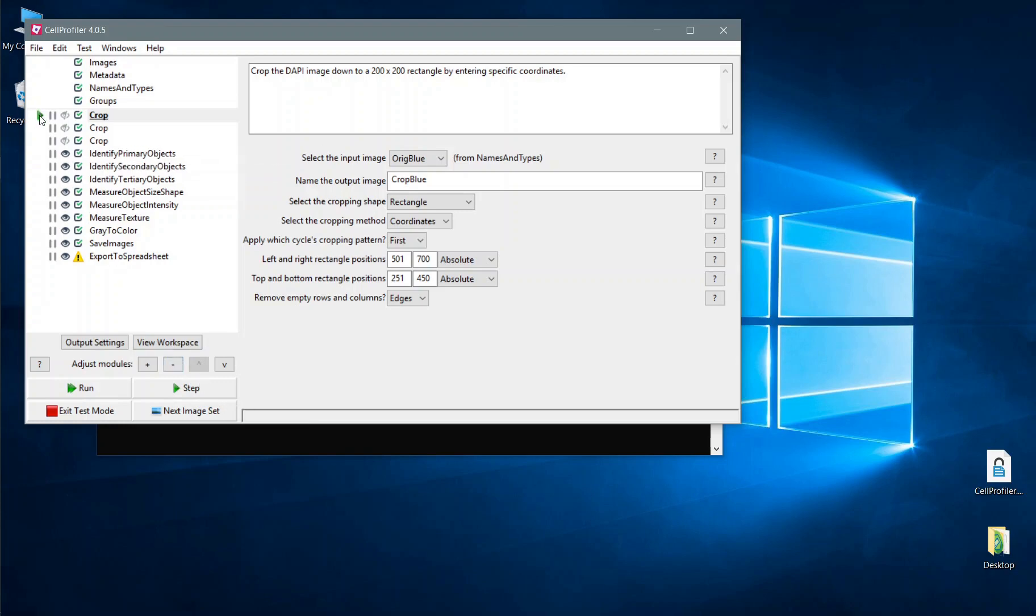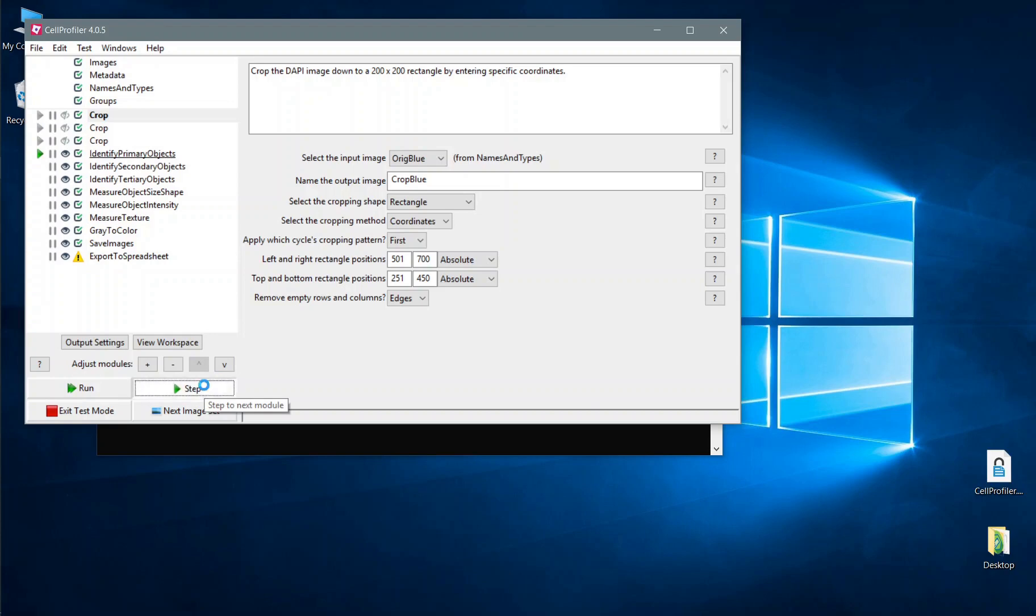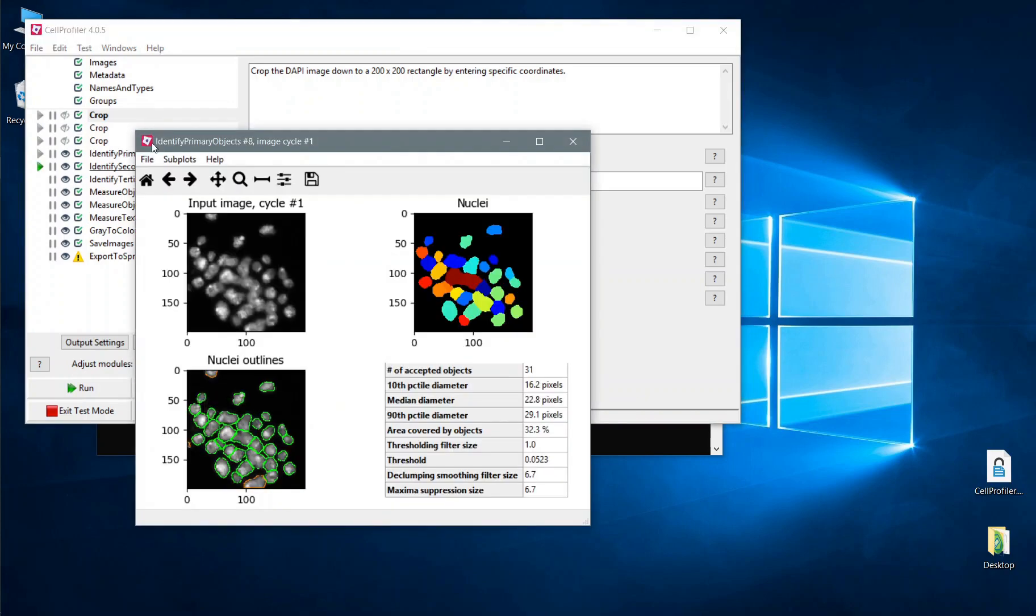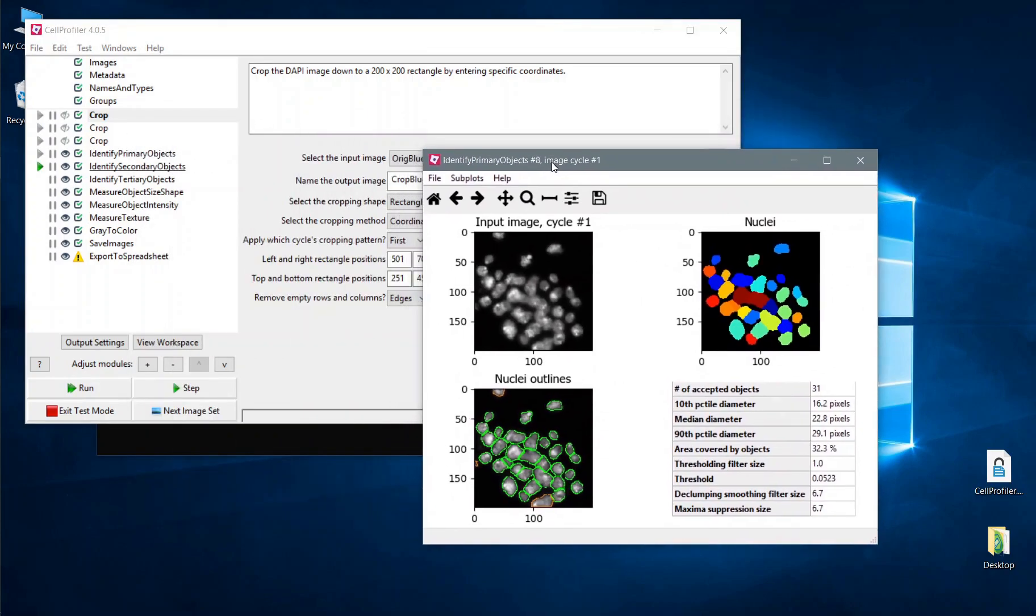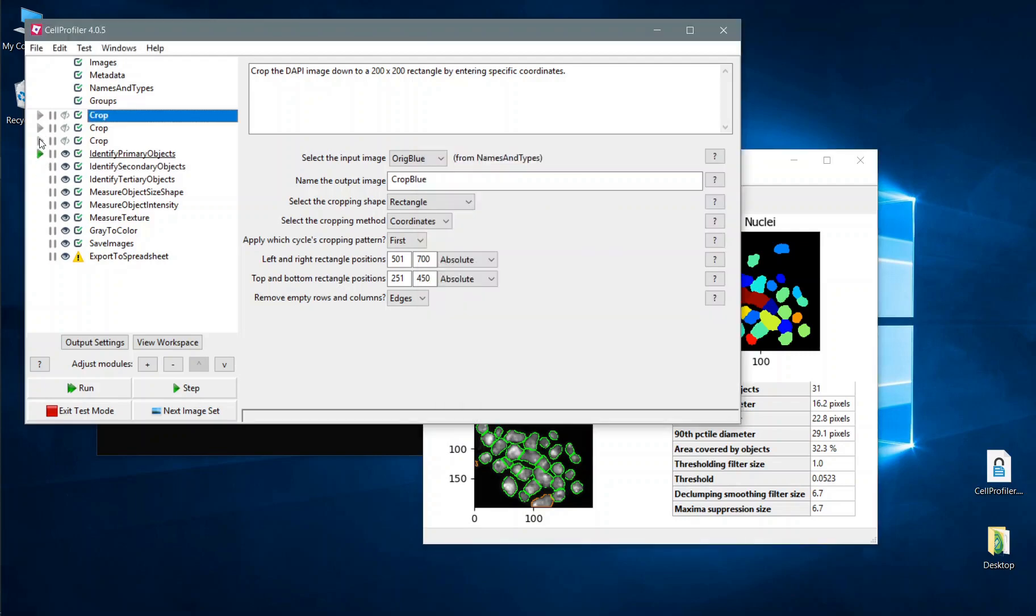So you'll see this icon here, we're on the first module. If we click step we have now executed the first crop module and the second and the third, and now we will select Identify Primary. One of the useful things here is that these greyed out icons can be used to hop back and re-execute any particular module that you want, so if we were to click the crop module you can see we've executed that and we would now be about to start the Identify Primary Objects module.